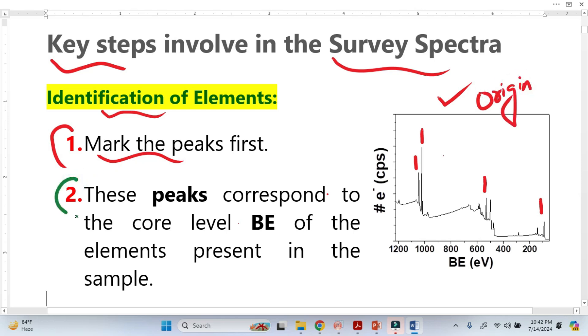Now the second step is these peaks correspond to the core level binding energy. Like this here, you see this peak belongs to this binding energy, this peak belongs to this binding energy. Let's suppose this peak belongs to 900 electron volts here. We can also do this by Origin.